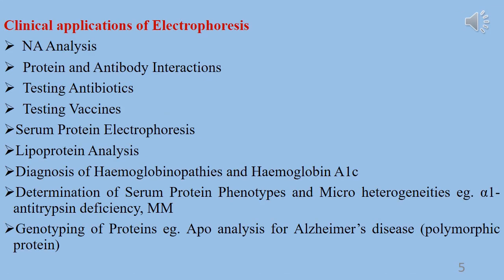Clinical application of electrophoresis. Nucleic acid analysis. It is the identification and study of DNA and DNA fragments. DNA is notable for the consistency of its negative charge, which means that the electric current applies roughly equal forces to any portion of DNA. Under that pressure, larger and smaller fragments of DNA begin to separate because they are all affected differently by friction from the test medium.